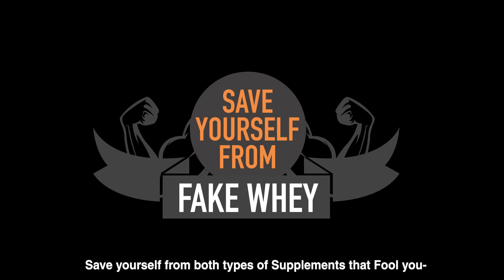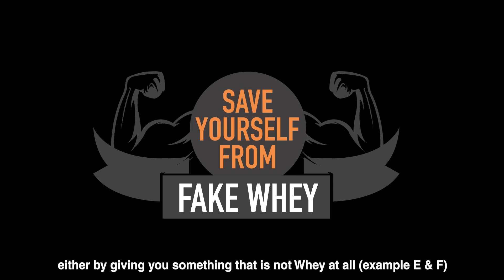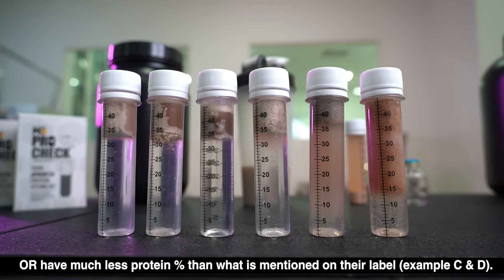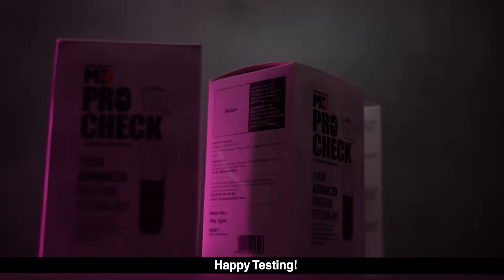Save yourself from both types of supplements that fool you — either by giving you something that is not whey at all (example: E and F), or by having much less protein percentage than what is mentioned on their label (example: C and D). Happy testing!